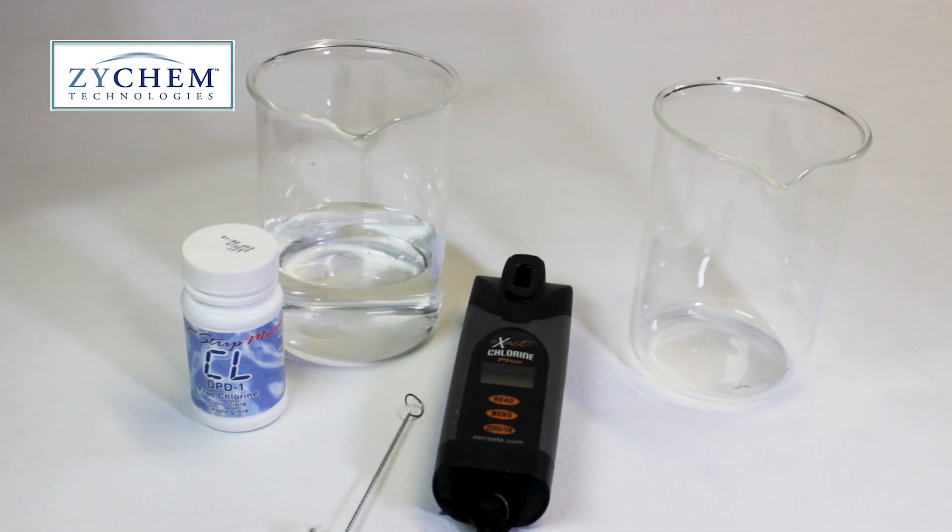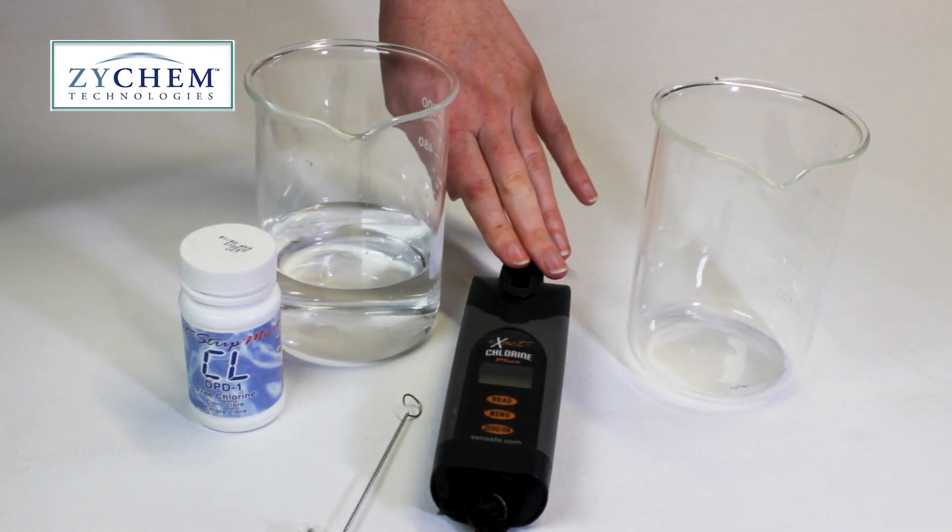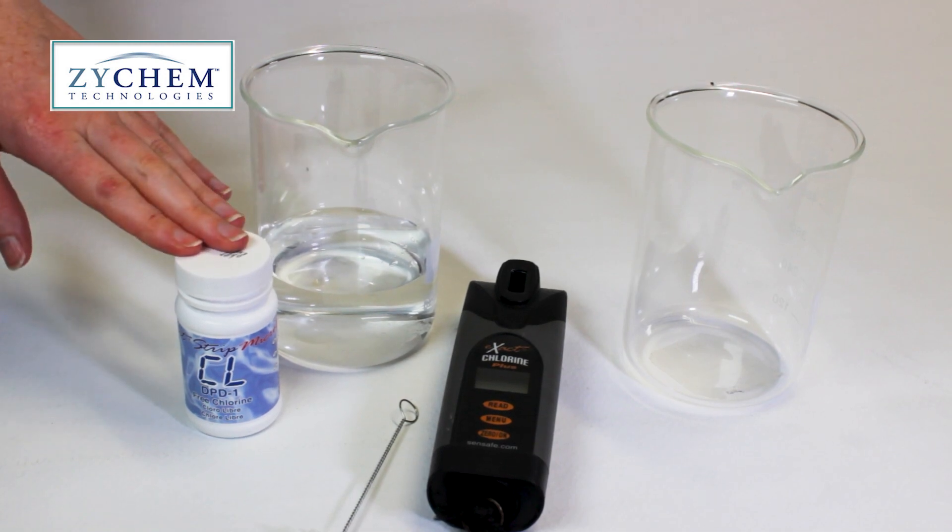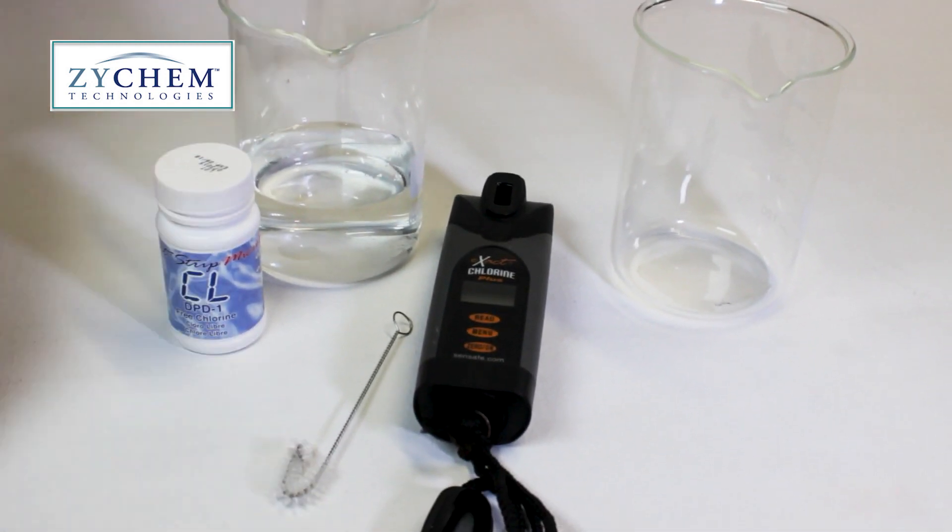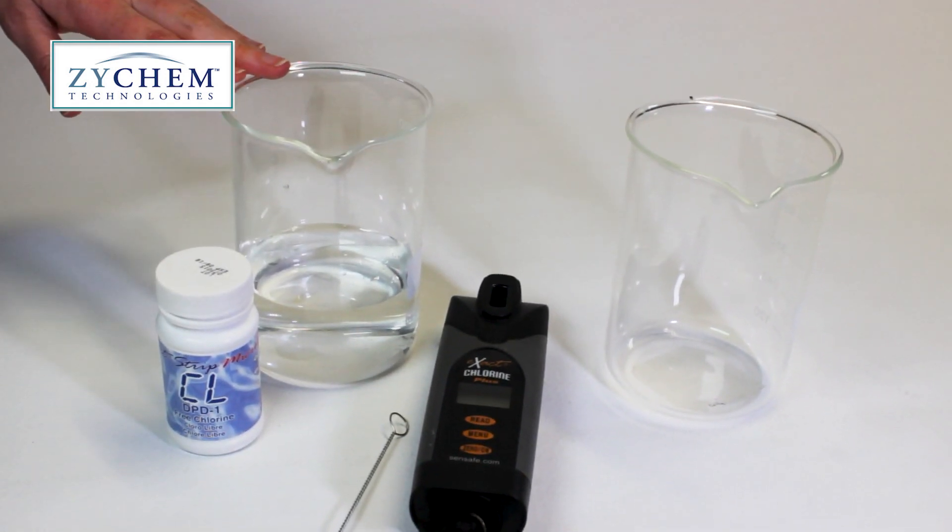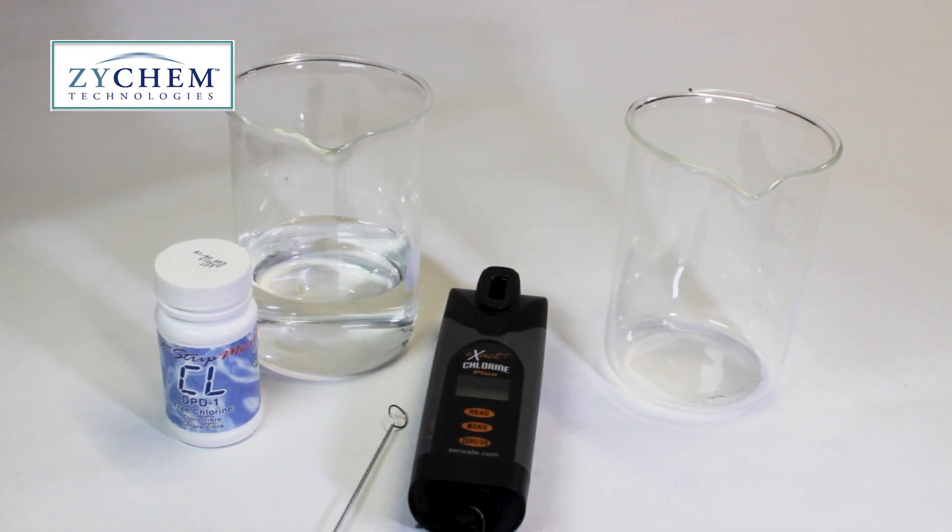For the test you'll need the photometer, the DPD-1 strips which come in the kit, the cleaning brush also from the kit, and the water sample you're looking to test.